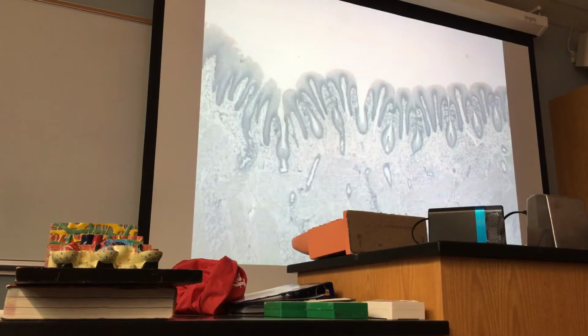And this has been prepared from Mr. Bunny Rabbit. And what you see by the side of the groove, these are taste buds. I'm going to show you. Taste buds.